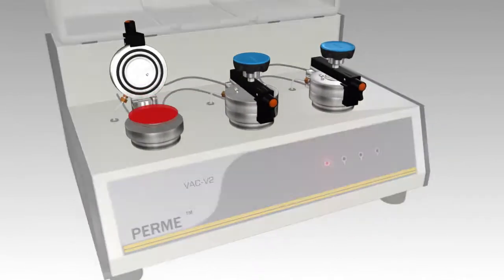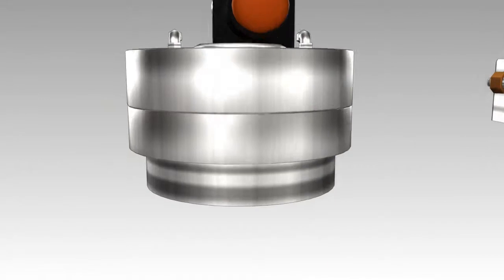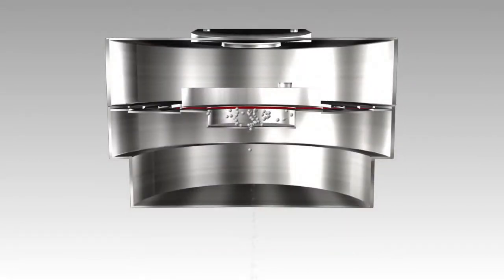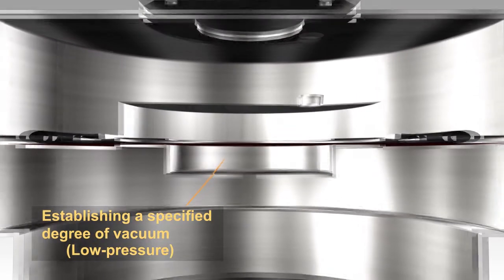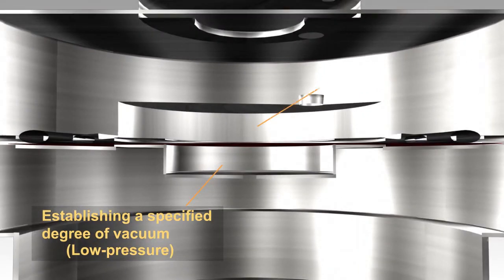VACV2 works by firstly establishing a specified degree of vacuum in both upper and lower chambers, then feeds test gas to the high pressure chamber until a certain degree of pressure is reached and ensures that a constant pressure difference is maintained across the specimen.